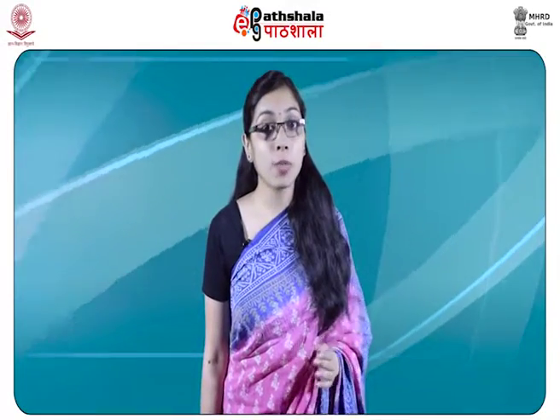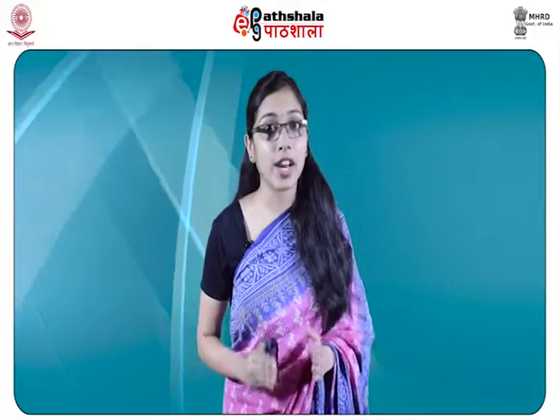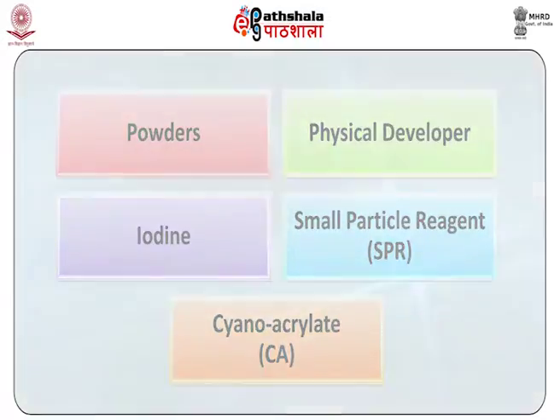These sebaceous components are valuable for latent friction ridge detection because they persist even in the presence of water and can be detected by a wide variety of physical and chemical techniques such as powders, physical developers, iodine, small particle reagent or the SPR reagent, and cyanoacrylate fuming technique.